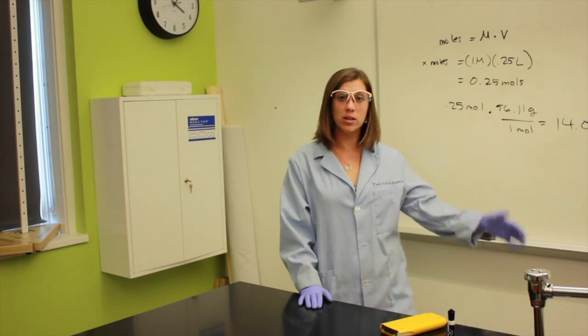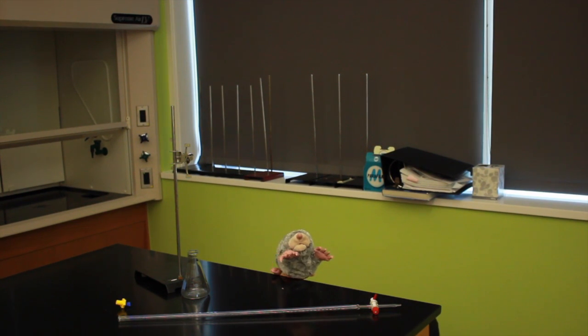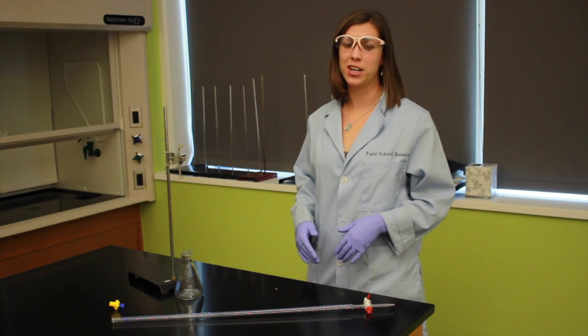Mr. Mole, do you have any other questions for me? As a matter of fact, I do. I'm supposed to do this titration thing, and there's burettes and titrant and... Don't worry, Mr. Mole. I can show you how to set up a titration.